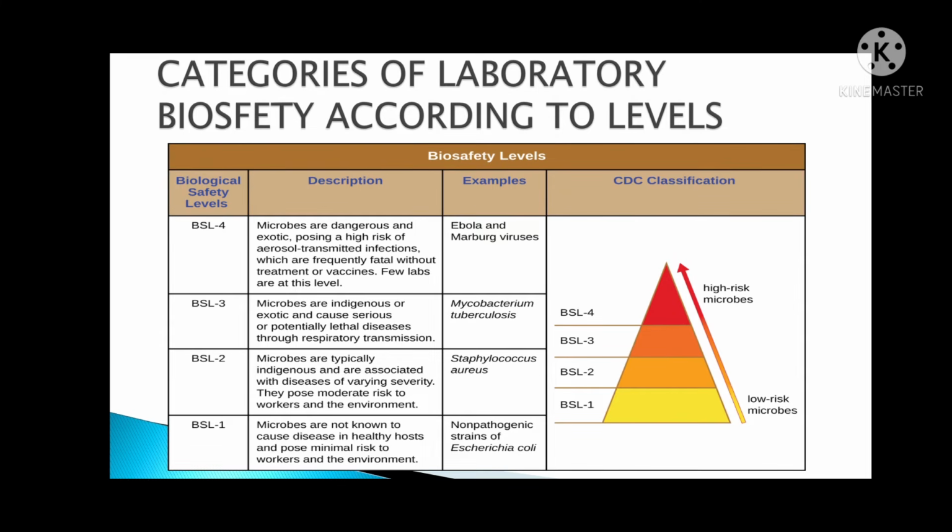Aside from the risk groups, we must also learn the categories of laboratory biosafety according to their levels. In order to facilitate precautionary measures, the Centers for Disease Control and Prevention categorize laboratories into 4 biosafety levels.